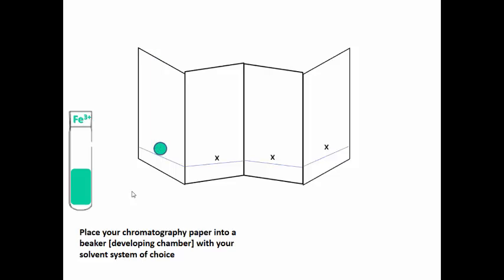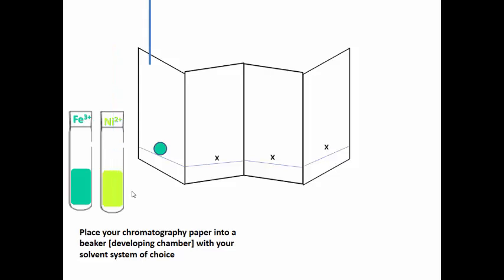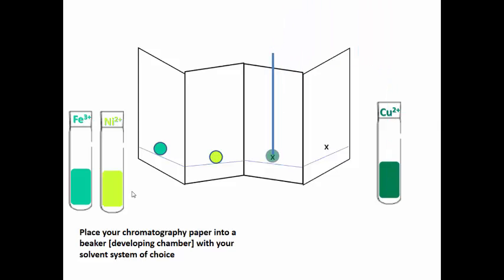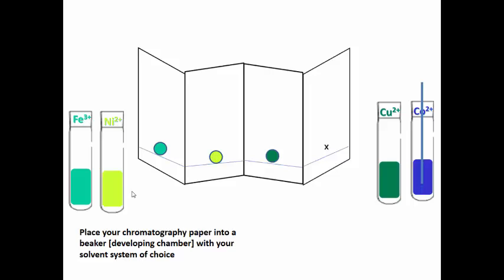Now I have my iron spotted above the one centimeter line. Then I'll bring in nickel and go ahead and spot that on the chromatography paper. Then I'll bring in my copper ions and spot that in the third panel. And then I'll bring in my cobalt ions and go ahead and spot the cobalt onto the chromatography paper.